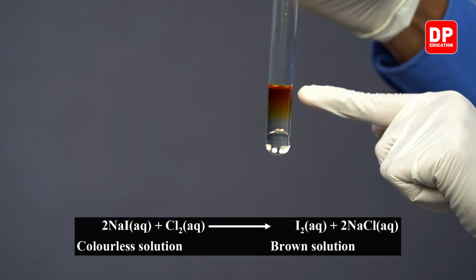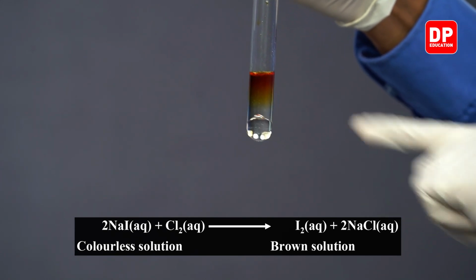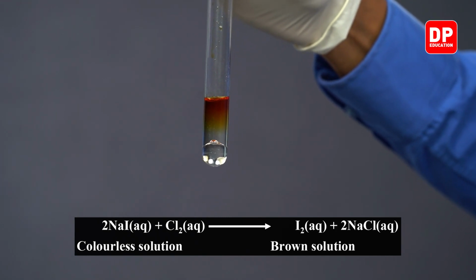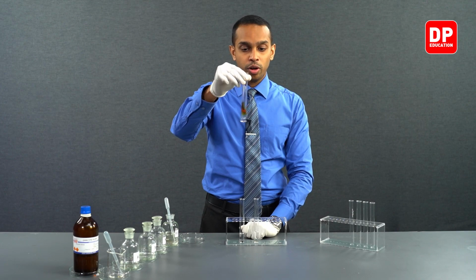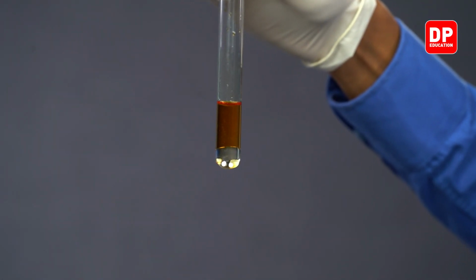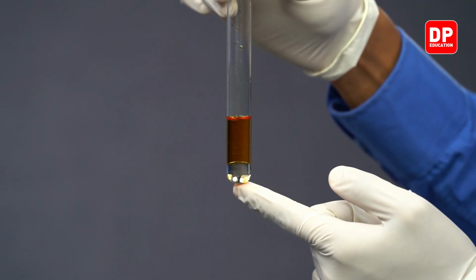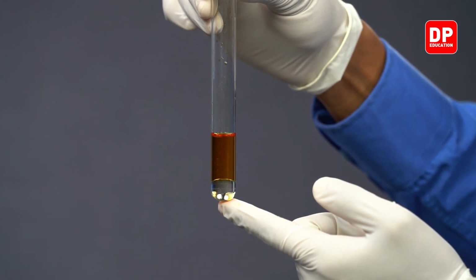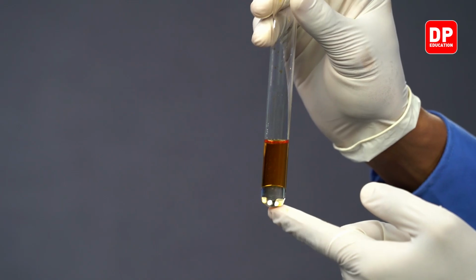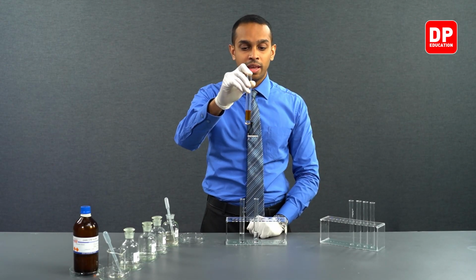Now I2 is dissolved in the water layer. I haven't mixed it up yet, and you can see due to dissolving I2 in water, there's a slight brown color present. So if I shake it a little bit, you can now see the brown color is evenly spread in the water layer. Still, it has not gone into the carbon tetrachloride layer, which is the organic layer. Currently, iodine is dissolved in the aqueous layer.